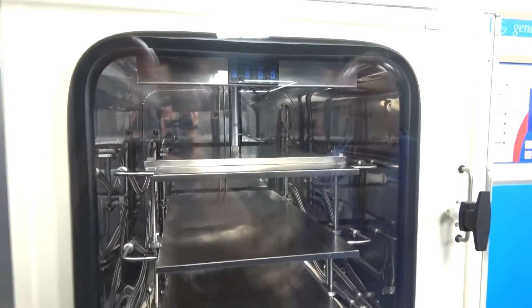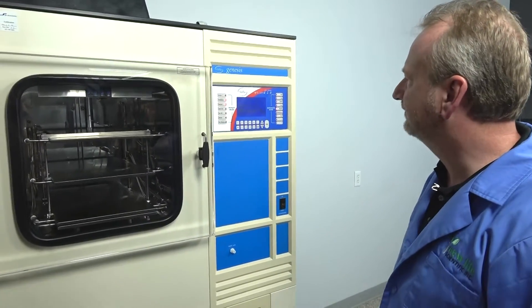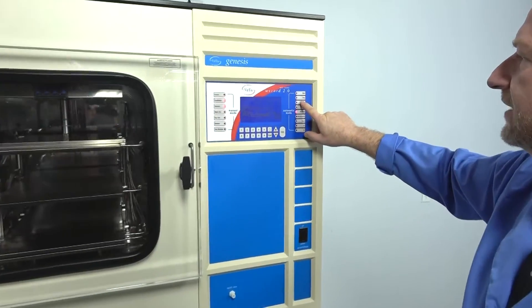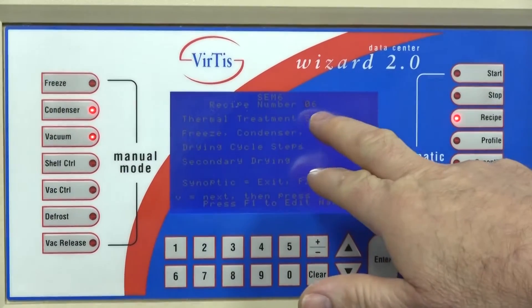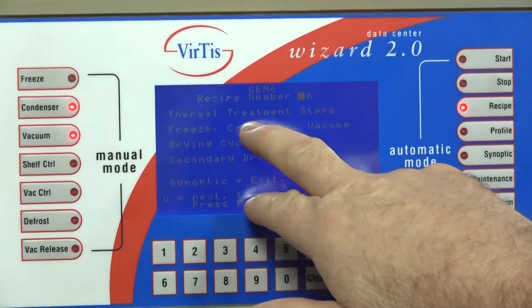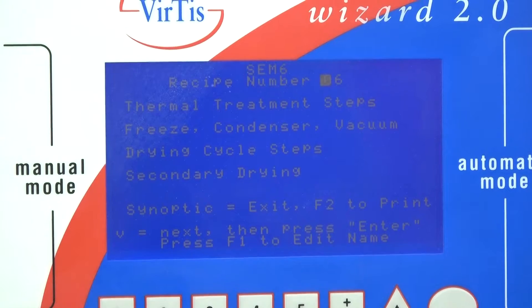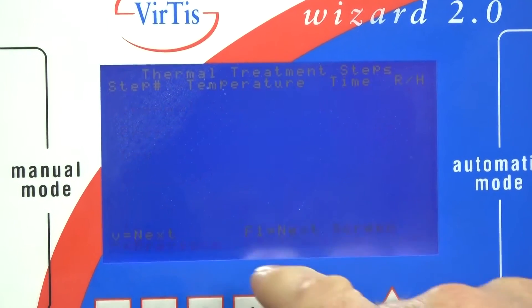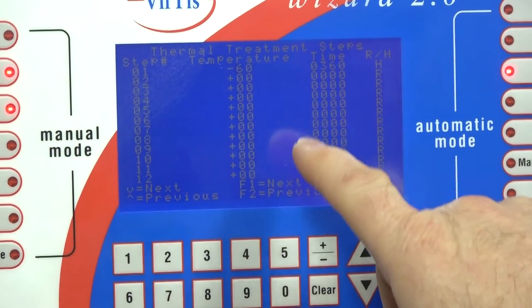This has recipe-built-in software where you can go in and program your specific recipes. That's all done on the control panel of the Wizard 2.0 — you simply go to the recipe button, start out by selecting your recipe number, and then you can see the first line would be your thermal treatment steps, which is where you freeze your products. Going to that step and hitting enter, you've got 12 steps you can incorporate into the thermal freezing part.